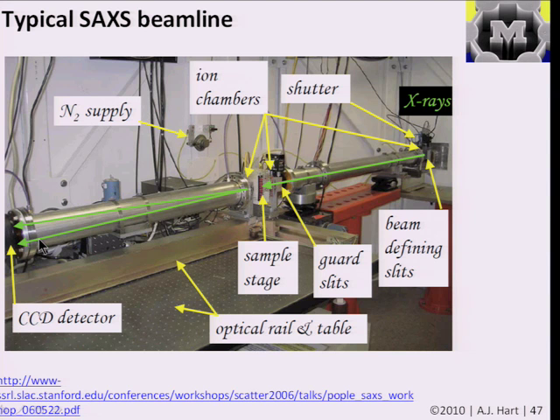And as you can imagine, the size of the detector and the distance that you place the detector from your sample determines the angles that you collect. So if my detector is, say, this big and way out here, I'm going to collect a certain scattering angle. If it's way up here, then I'm going to collect a wider set of scattering angles, and that's based on the configuration and the information that you want to detect.